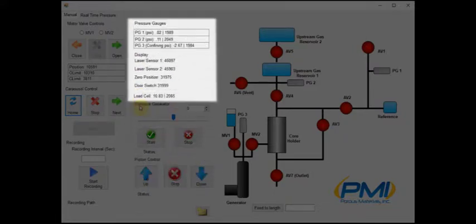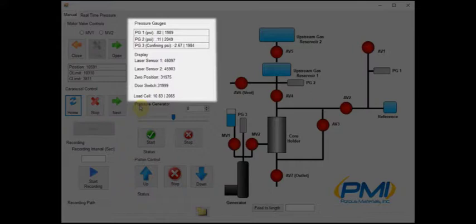Above this we can monitor the load cell, door switch, zero position, laser sensor 2 and 1 as well as pressure gauges 1, 2, and 3.